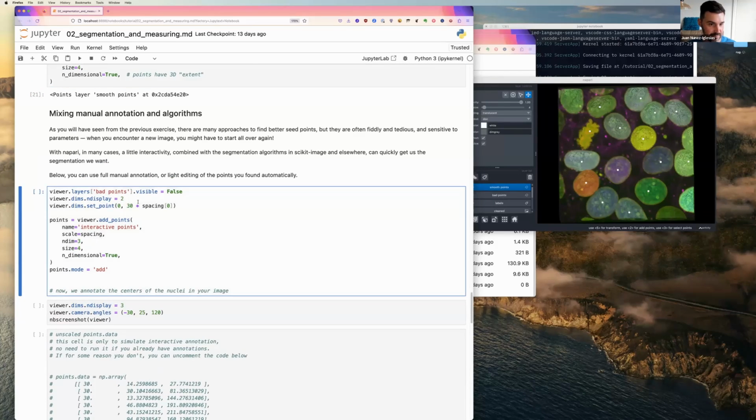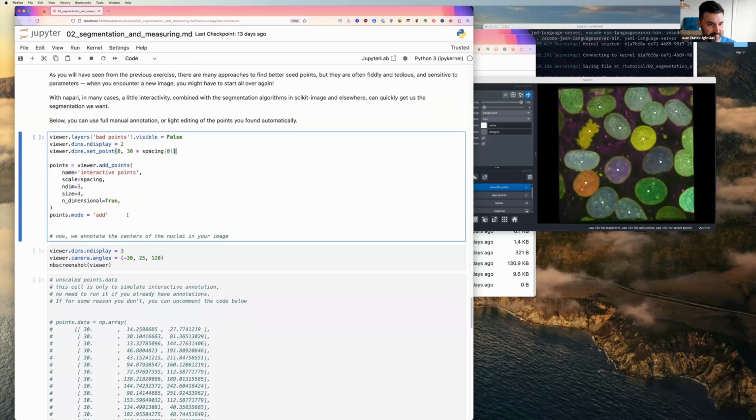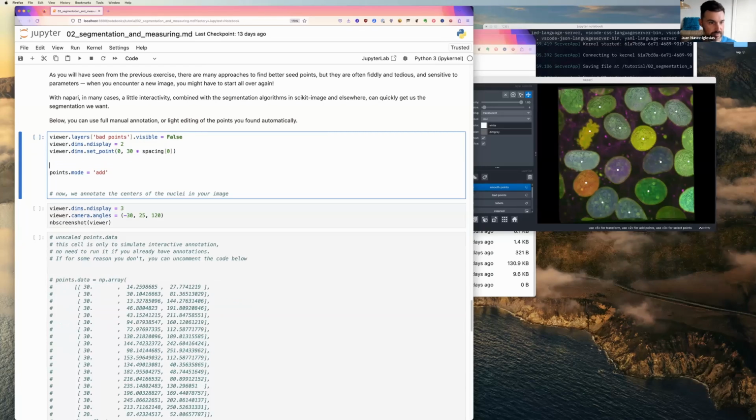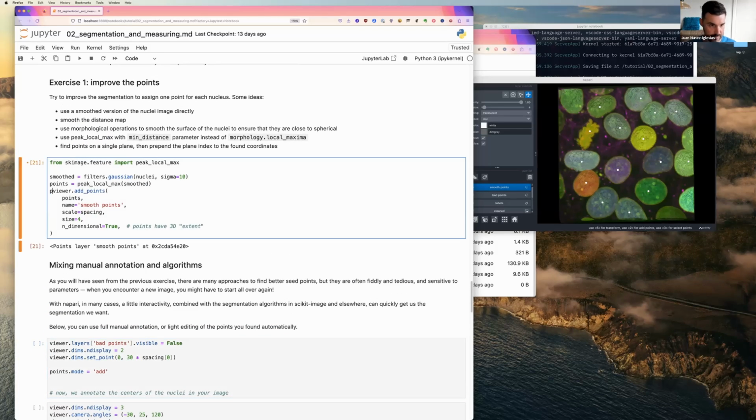I don't think I need this. Set point. Yeah, look, why not? Okay, I'm not going to do this though. I need to do this. This, I'm going to get rid of this later, sorry. Okay.